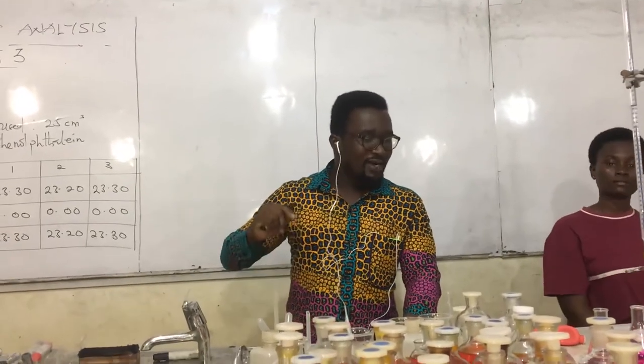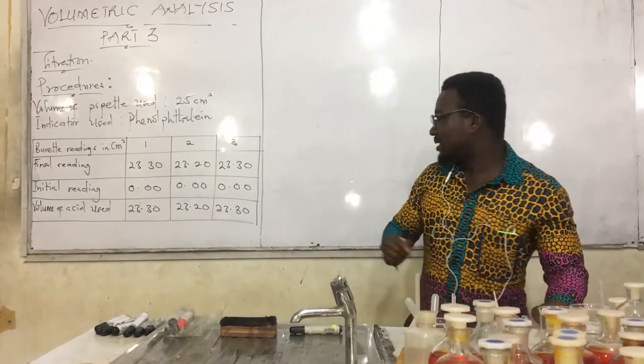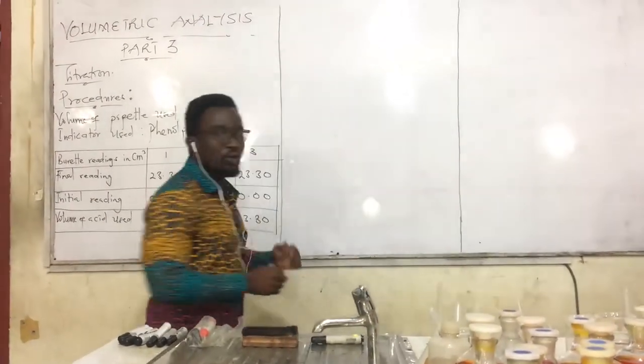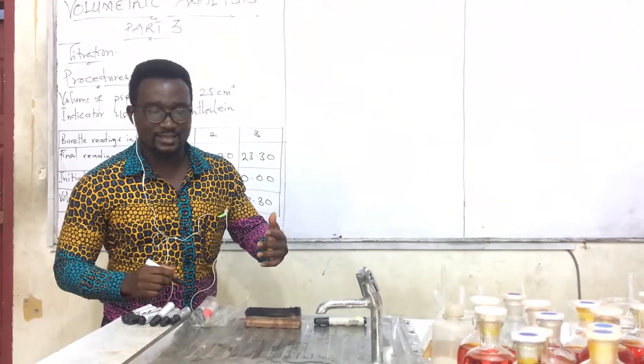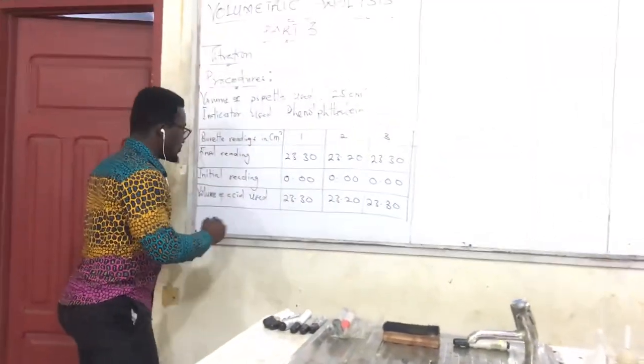Today, we have been able to go through the titration. The titration was between a weak acid and then a strong base.